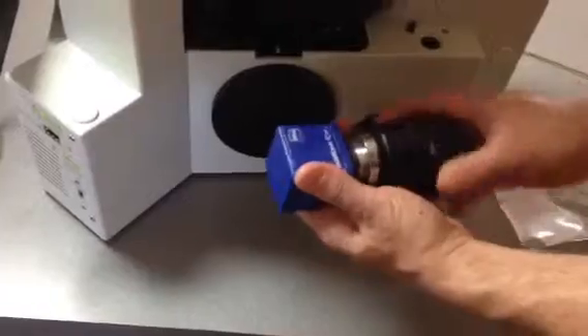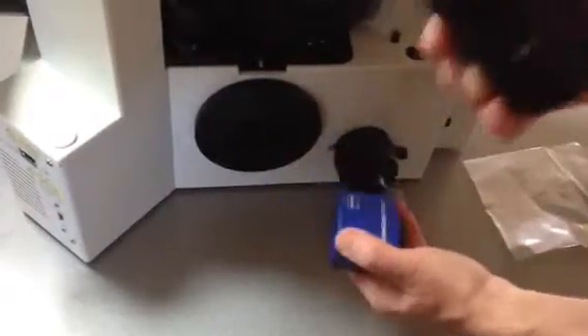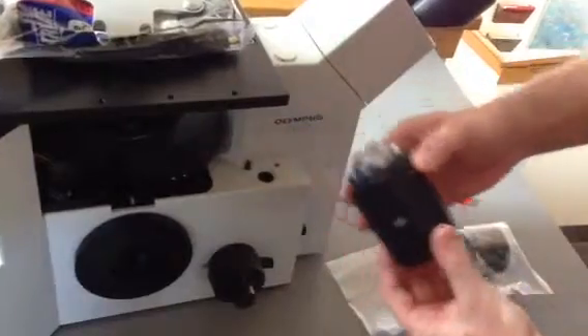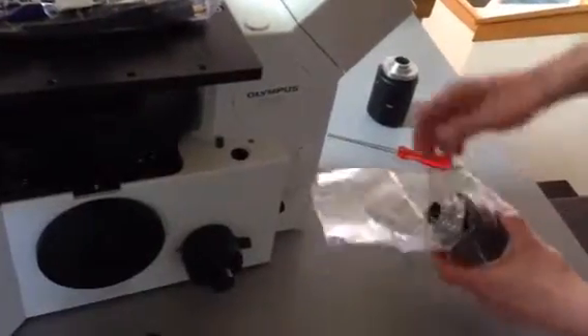You're then just going to unscrew and remove this adapter. This is the adapter that's going to go back down into the box and into the baggie and be returned.